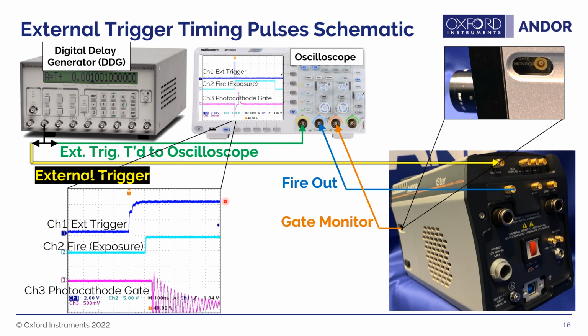This is just very common in these instruments. And so you can see a sharp edge here. That's where you want to trigger off of. So you can see this little arrow is triggering off of right there, so you're not getting a less steep area to trigger off of.